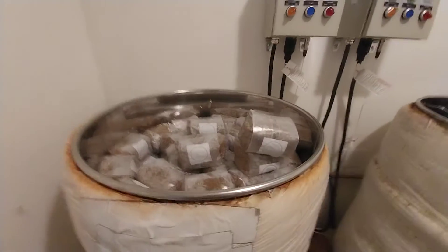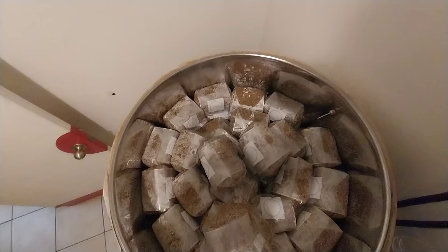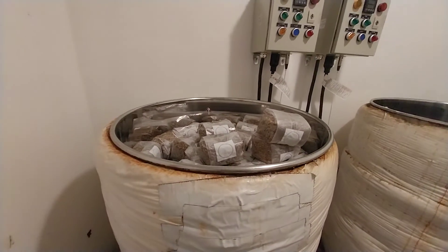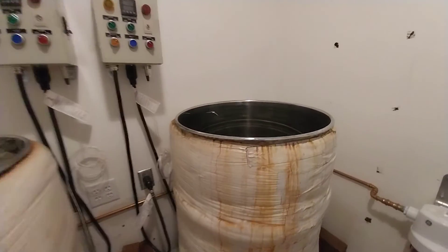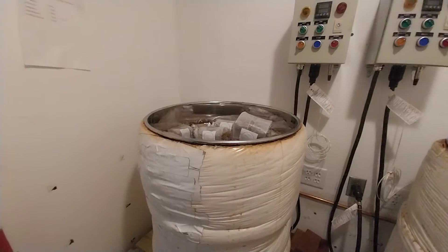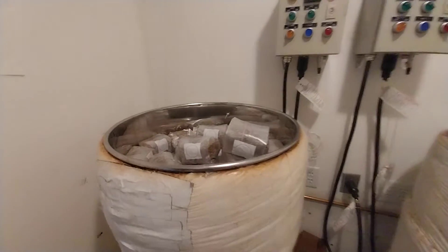It's gotten so bad that when I reach up here and down into the bottom, I'm actually developing nerve damage in my shoulder from the overreach. So we're going to have to reinvent the system just so I can keep doing this. We're probably going to go to a horizontal system that is designed to be much easier to load.